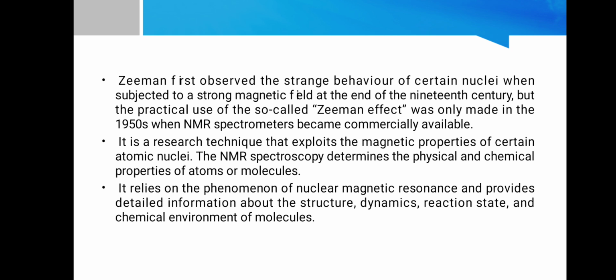Zeeman first observed the strange behavior of certain nuclei when subjected to a strong magnetic field at the end of the 19th century. But the practical use of the so-called Zeeman effect was only made in the 1950s when NMR spectrometers became commercially available. It is a research technique that exploits the magnetic properties of certain atomic nuclei. NMR spectroscopy determines the physical and chemical properties of atoms or molecules. It relies on the phenomenon of nuclear magnetic resonance and provides detailed information about the structure, dynamics, reaction state, and chemical environment of molecules.